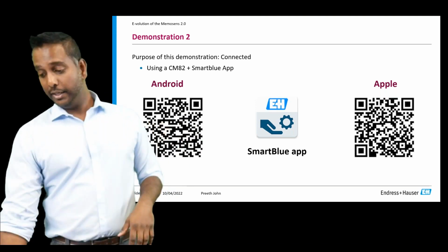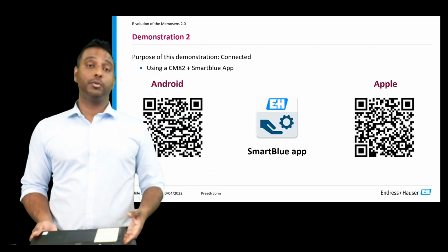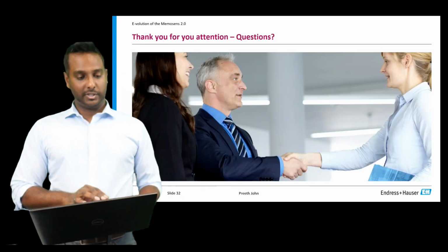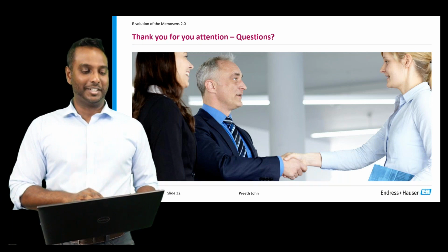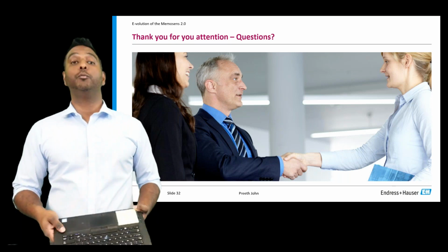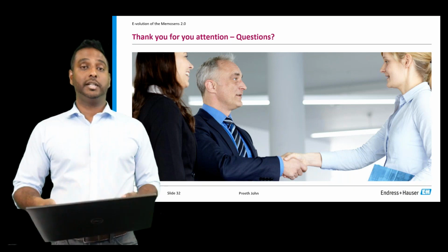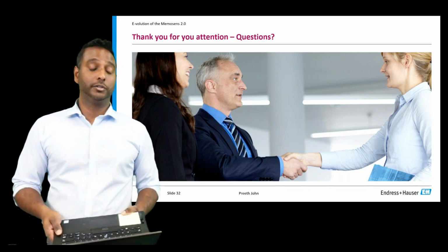I've got this here in front of me, and I do have a couple of questions, so thank you for that. Now we're going to just go into the question time. The first question I've got, someone's paying attention, I mentioned, will the CM44 be EX soon? The answer to that is yes, it will be. We will make sure that we publicize that to everyone. It has been something that has been rolled out this year from the factory. So stay tuned on that note.